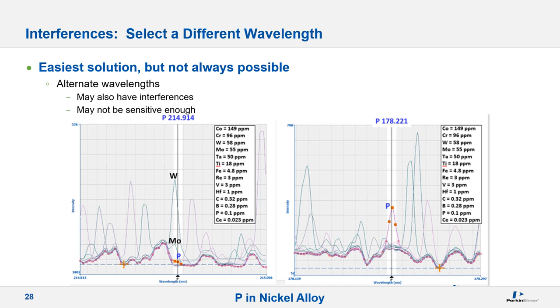When we sent these results back to Shanghai, our colleague reproduced them and did a quantitative test and was able to recover the 0.1 ppm spike within 10%. This methodology was then implemented at the customer site.